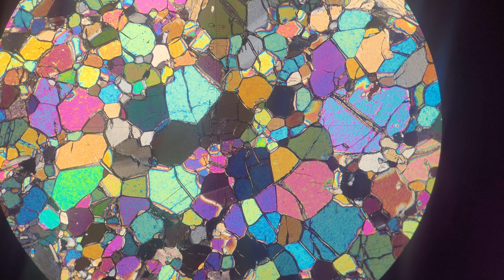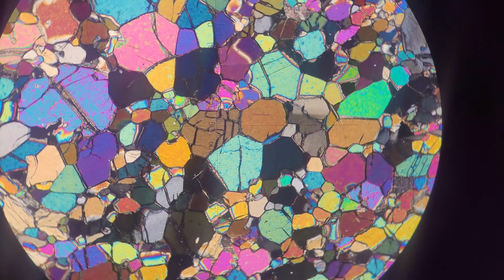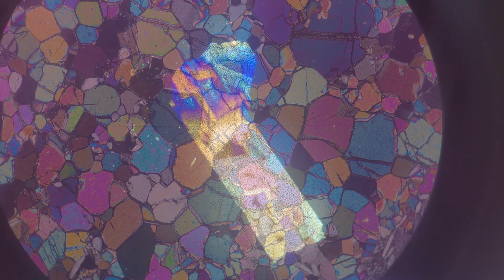The birefringence is measured through the color of the crystal under cross-polarized light. Just make sure to rotate the stage so the mineral isn't black. We'll get into that next.